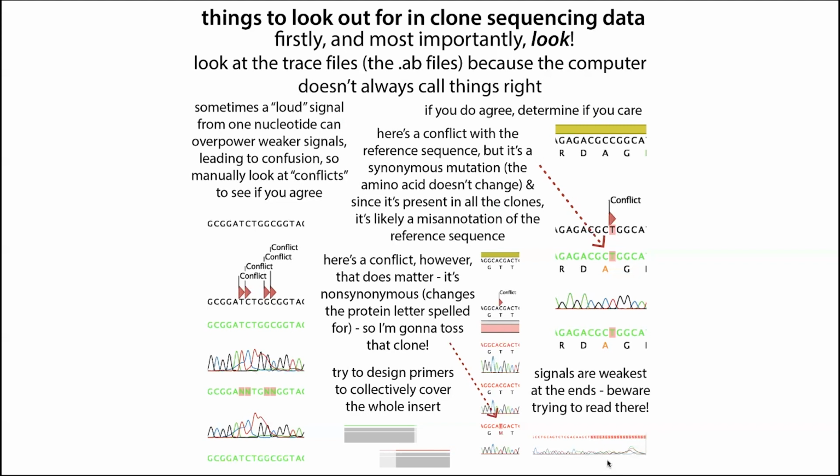Well, sometimes this happens in the beginning and the ends of the reads, in addition to those spaces being close together or having contaminating things where the louder signal is going to outcompete. In the beginnings and the ends, so basically the first 50 and last 50 or so nucleotides that are read out, you can't really trust them. And so often they'll have Ns, but sometimes they'll actually try to guess some of them, and basically you just don't trust this.